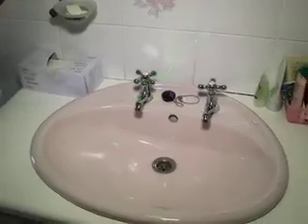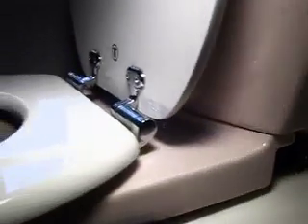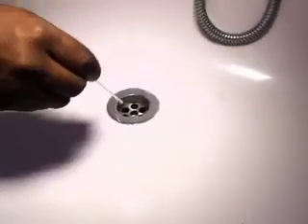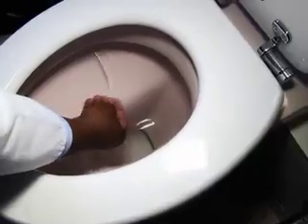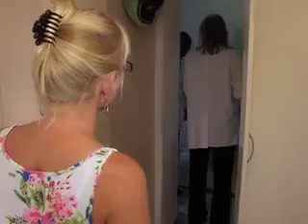As the most commonly used room in any house, the bathroom provides a number of surfaces for bacteria to thrive on. The test is really not to determine whether you have bacteria in your house. It's really to show you that there is. We're confirming that there is bacteria, and we're going to give you an indication of the amounts of bacteria. Swab samples are collected from all over Dawn's bathroom to conduct a microbiological audit.